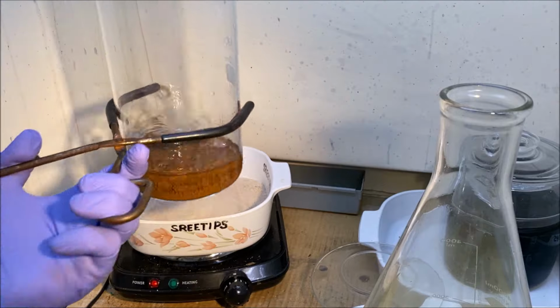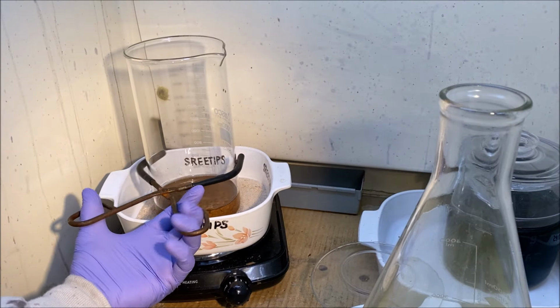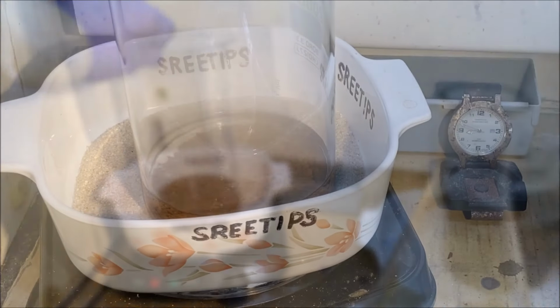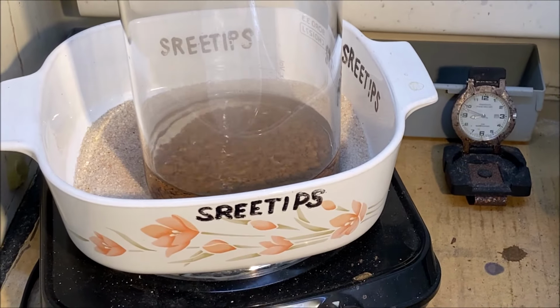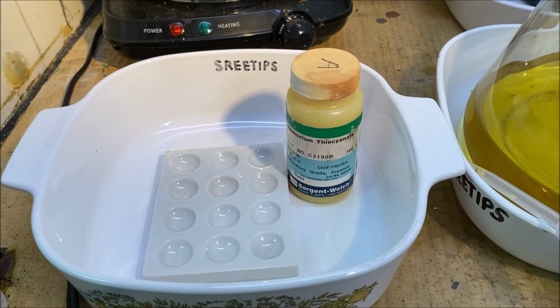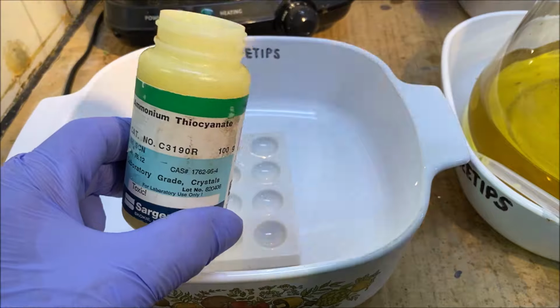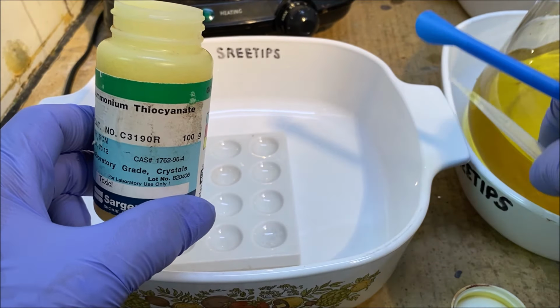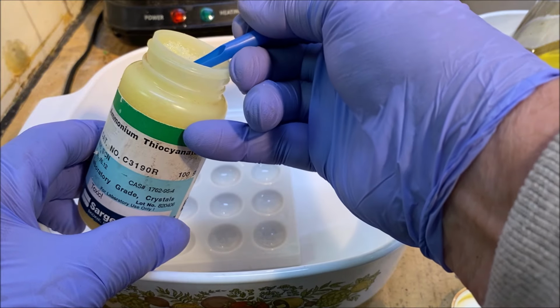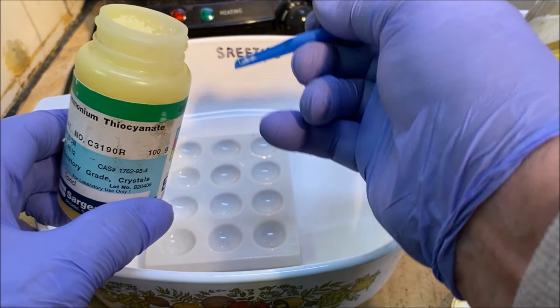A little more hydrochloric acid, set it back up on the heat, and let it continue to boil. Had this up here boiling in hydrochloric acid for quite a while. I'm gonna repeat our test now. Get a little bit of ammonium thiocyanate into a couple of cavities in our spot plate.